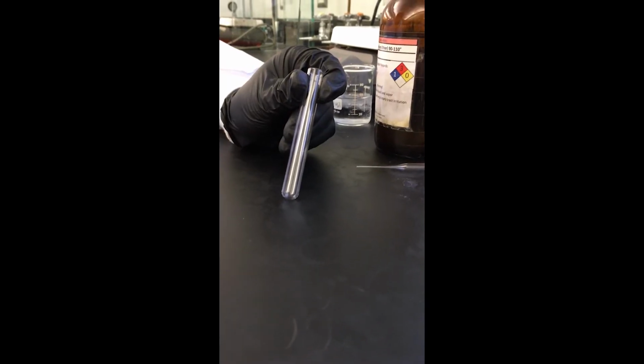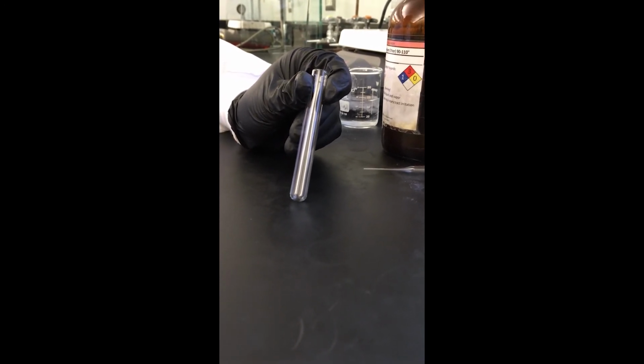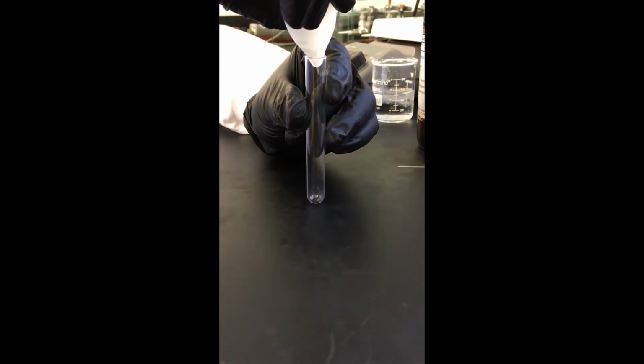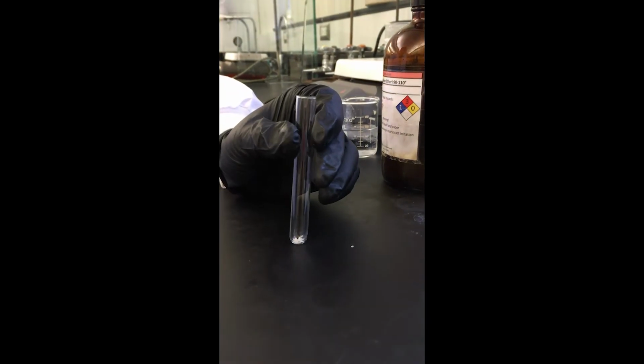Okay, so now I'm going to go ahead and recrystallize our crude product from the Diels-Alder reaction. So I have here our crystals. I'm going to go ahead and take these and add them to this test tube. So now we've got our crystals in there. And then I'm just going to go ahead and add a little bit of ligroin.